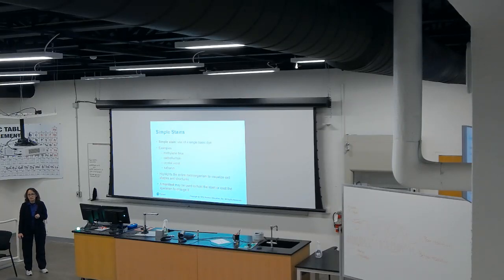If you want to retain this stain or this dye, you can use something that's called mordant or fixative agent that holds the stain inside, or even sometimes can enlarge the structures.